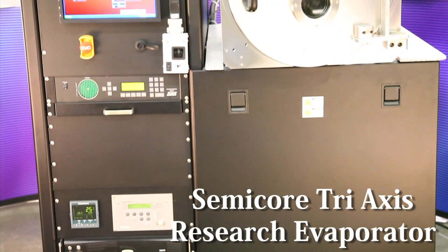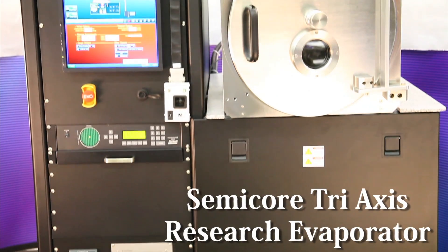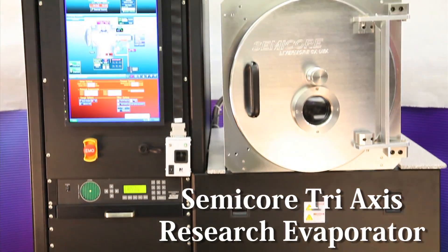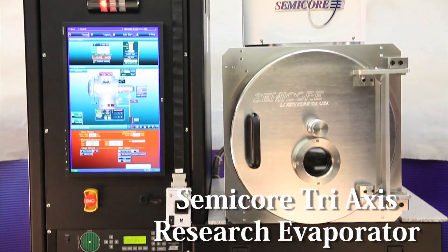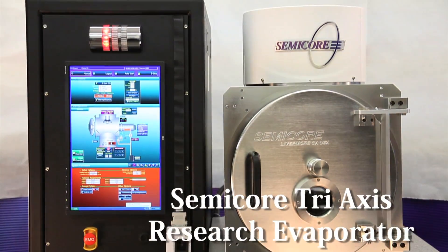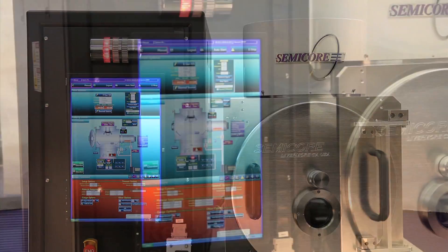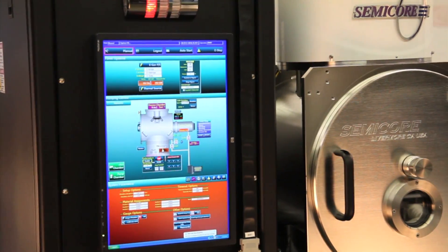This will be a video demonstration of a Semicore single-chamber tri-axis research evaporator with two sources.